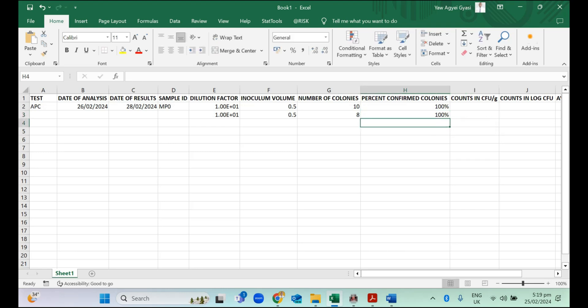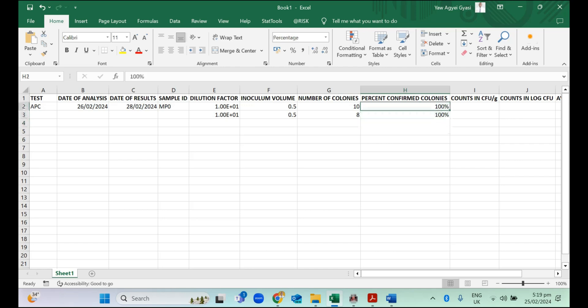In the case of some other tests like Staph aureus, like Escherichia coli, E. coli, like yeasts and moulds and others, if you went on to do any confirmatory test and you have some percentage of your colonies showing positive and others negative, you can express that as percentage and include that here.